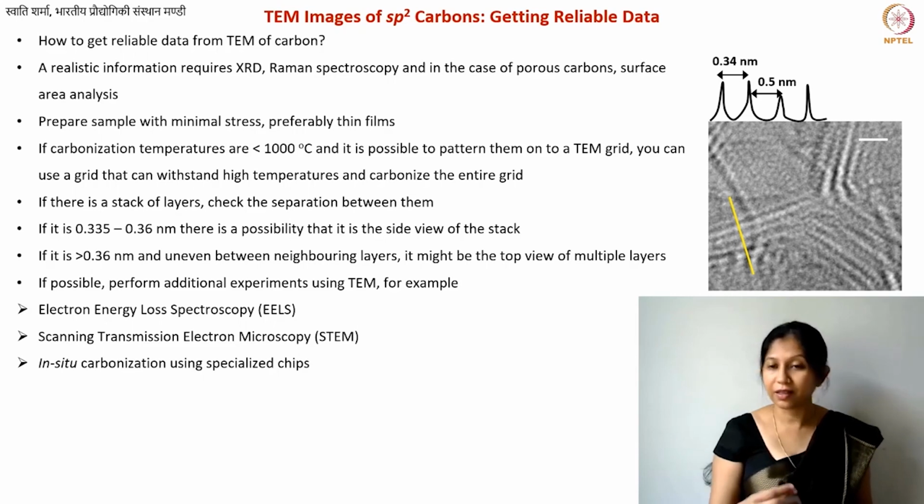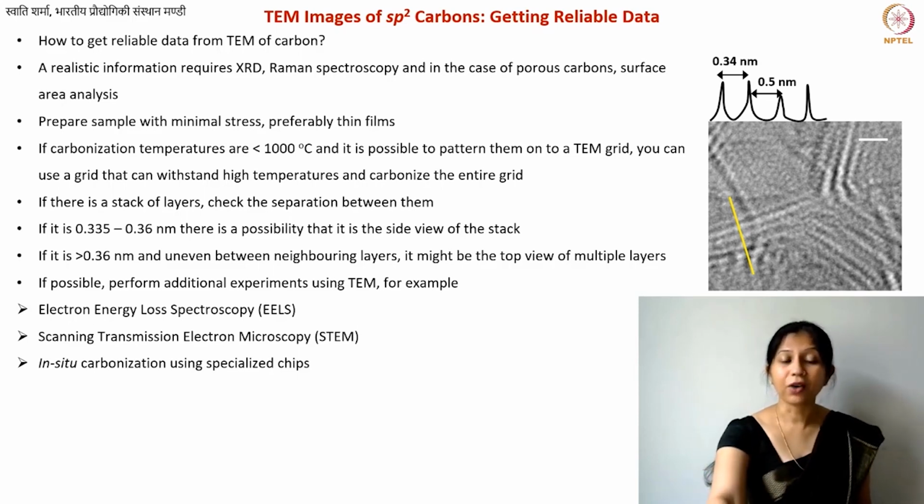And also these features are changing every day. So if somebody purchased a TEM microscope 5 years ago, that might already not have some of the recent features and so on. So this is a constantly changing field, and you cannot just buy a TEM every other year, for sure. Okay, the third one that I have written is in situ carbonization.